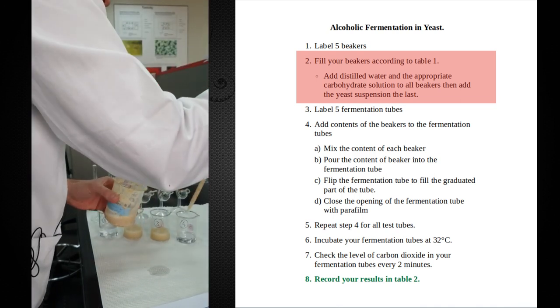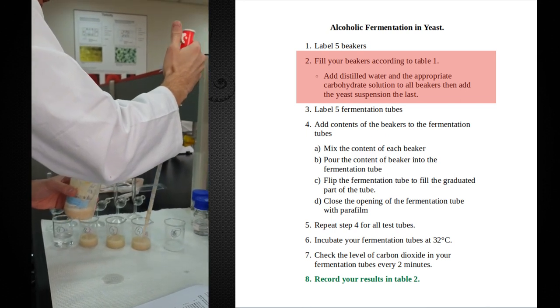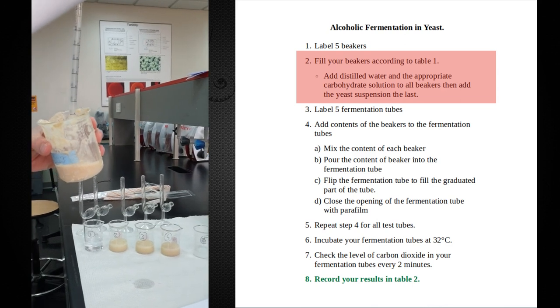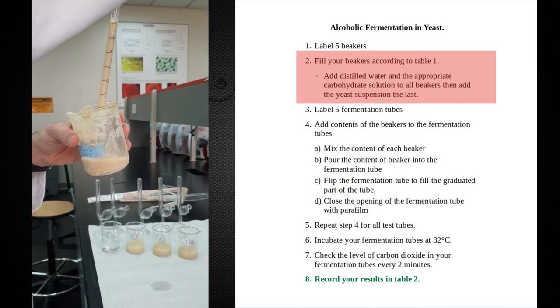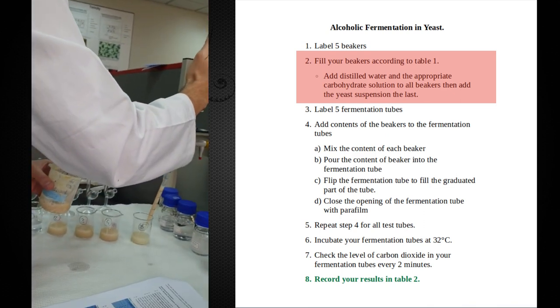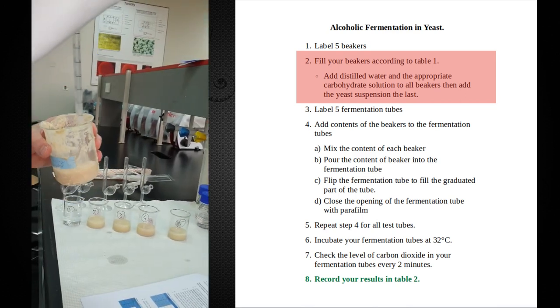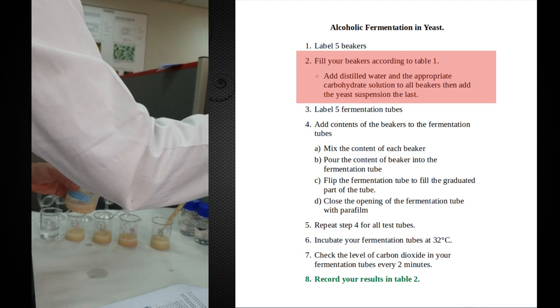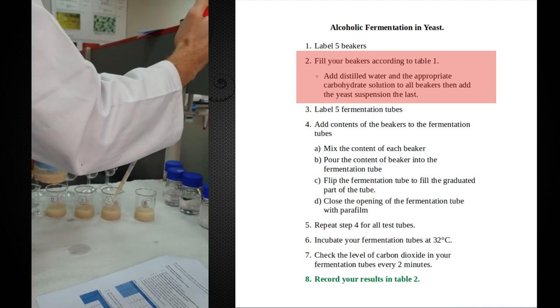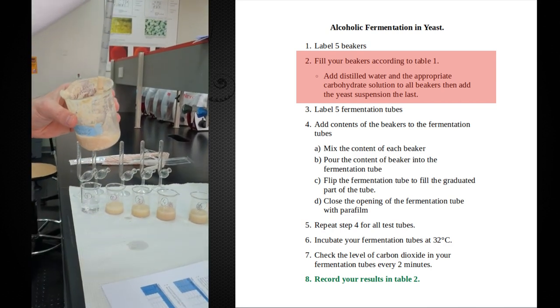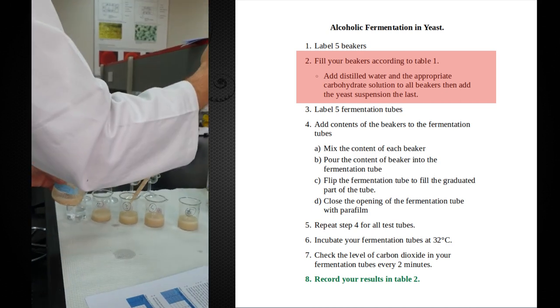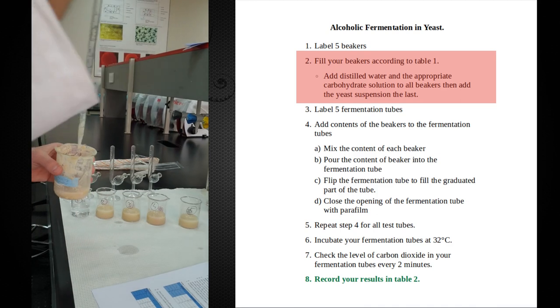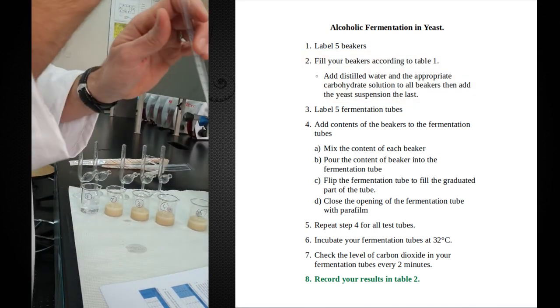I'm mixing in between each time just to make sure that my cells have roughly the same suspension, so they're about the same concentration each time. I want to make sure that all of the samples are going to be roughly the same number of cells per beaker. Now all of our beakers are set up and they are ready to go.